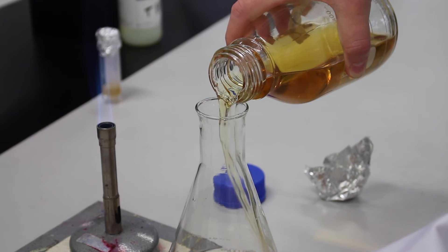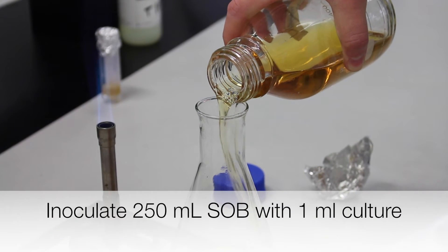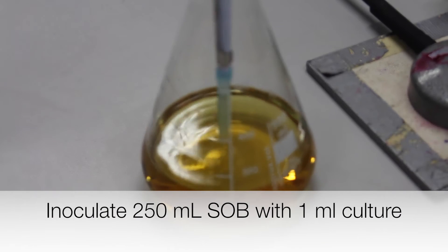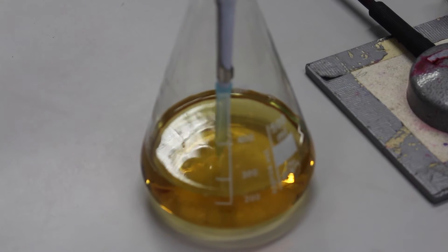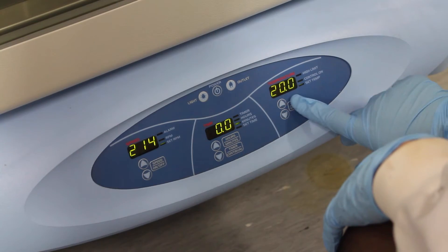To prepare competent cells, 250 ml of SOB medium is inoculated with 1 ml of the cells prepared earlier. The culture is allowed to grow at 20 degrees Celsius for about 16 hours until the optical density measured at 600 nm equals 0.3.